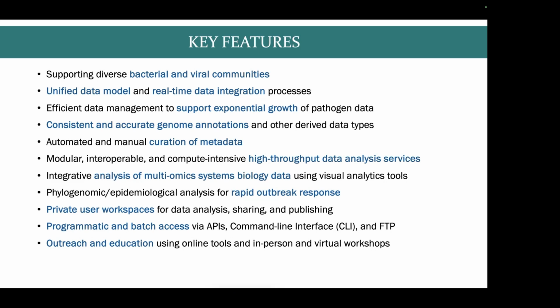As a user of the BV-BRC, you have a private workspace where you can analyze, share, and publish data. You can keep it private to you, within your lab group, and beyond. We also have programmatic and batch access, so you can access BV-BRC data via APIs, the command line interface, and FTP. Finally, we do outreach and education, like this webinar right now.